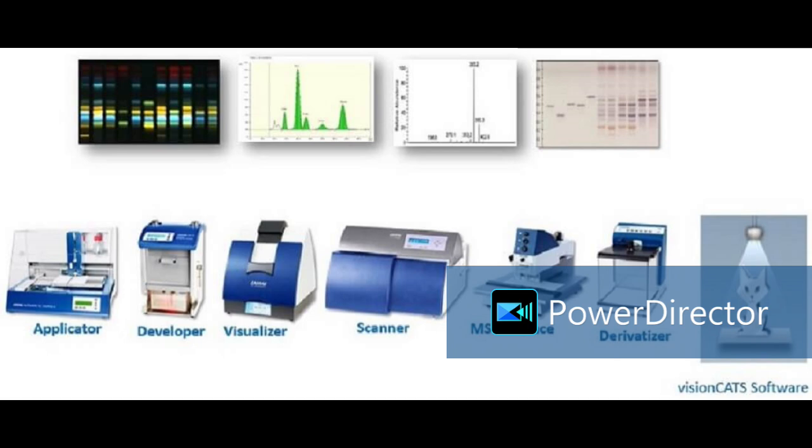Where did you conduct this work? Where would they do it? This is a Camag application note. Yes, they have screened in their facility. They screened for fentanyl also, LSD. They had standards.